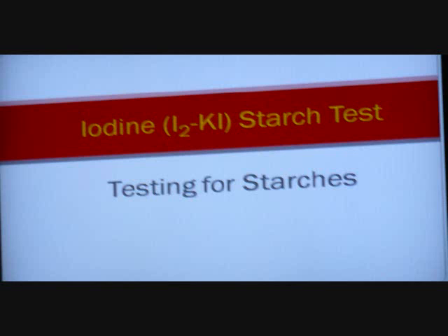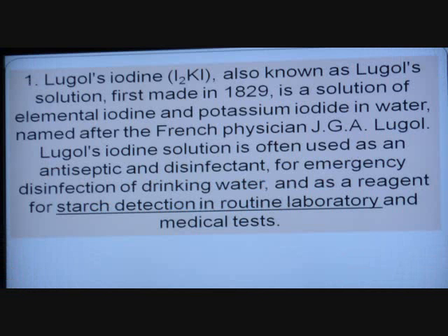You want to have Lugol here, so we have Graham. And Michelle thought it would work. We're going to find out. Y'all lied to me. Spell Lugol for me? It's on the slide. Okay. All right, there it is. What I really wanted was Lugol. But if it works, I'll use Graham. Graham, G-R-A-H-A-M. Oh, okay. But what I wanted was this one. And my PowerPoint is set up to show this one, but actually I'm using Gram stain.